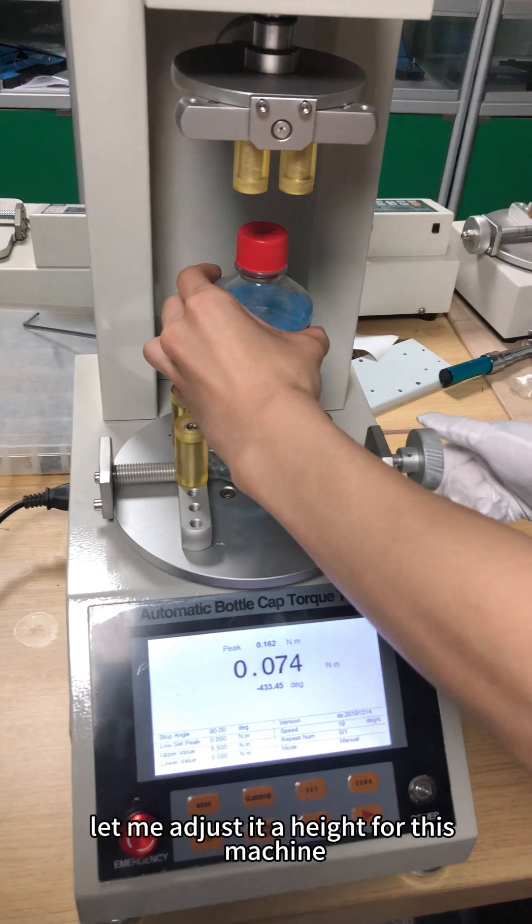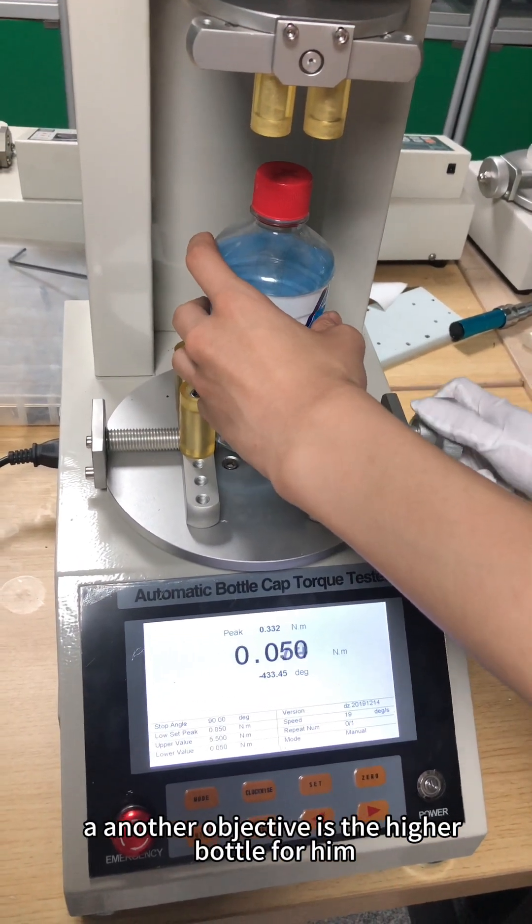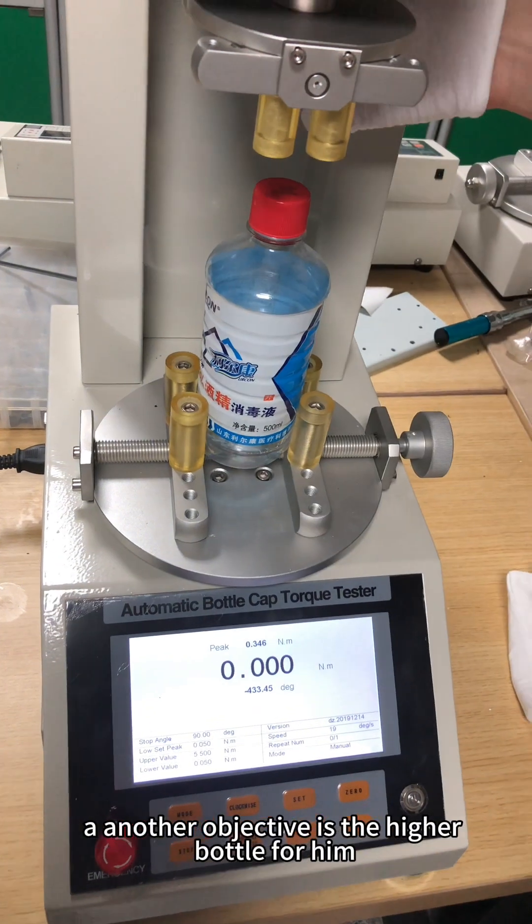Let me adjust the height for this machine, and let me change to another objective — it's a higher bottle here.